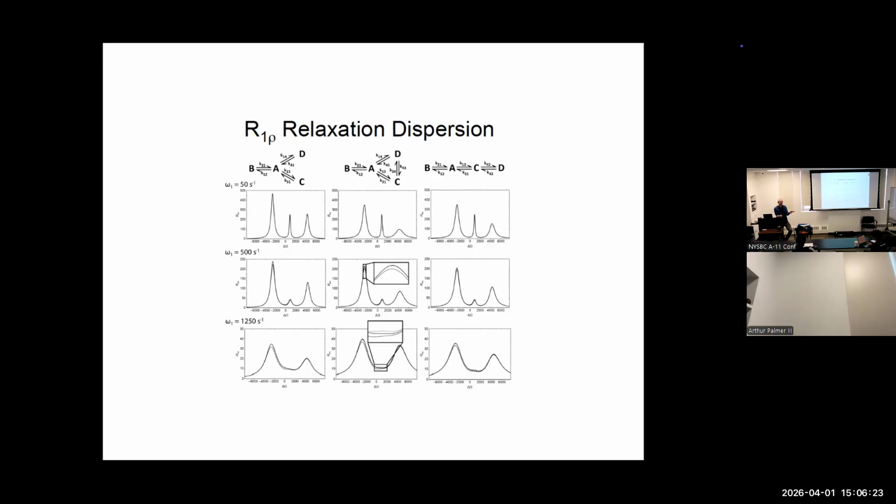And that's guaranteed if the populations are skewed. If the populations are more equal, there may be special circumstances where the eigenvalues are separated, but you can't guarantee it. So for the analytical approximations, the populations being different is important for guaranteeing separation between the eigenvalues. But if you are programming a computer to solve the matrix equation, it doesn't matter at all.